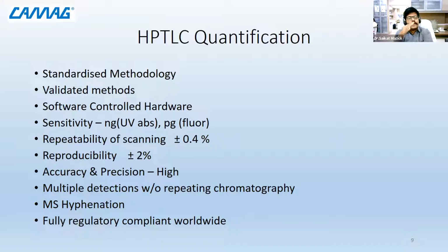So here, why is the ppm not directly coinciding with the concentration? Because here the amount is an absolute value. Once the standard solution is applied onto the plate, the solvent part evaporates and you have the pure quantity on the plate. So you can correlate it with the sample and find out at a pure quantitative level how much is present in the sample, and then change it into a percentage format so that you get the result.